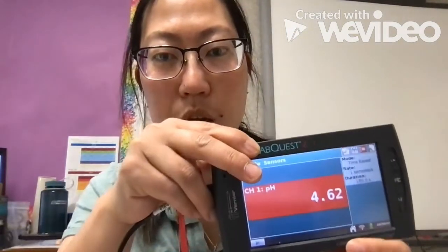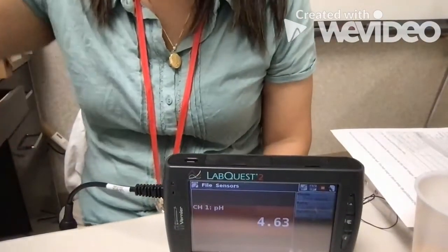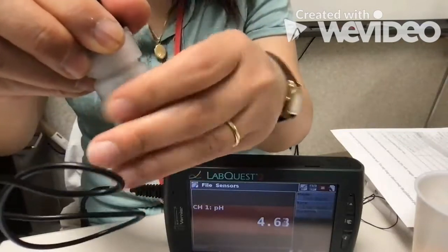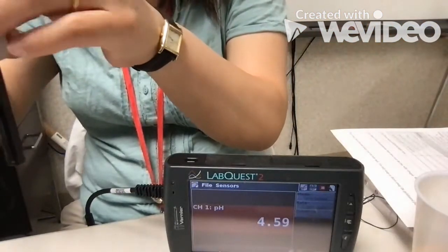The next part is testing pH with a meter. Okay, so now we're going to test the same solutions with a pH meter, and I have the pH meter right here. That's showing the pH. Let's see if I can get that showing. Okay, and the actual meter looks like this. It's a probe, and right now it's in some solution. I can take that out. Okay, and so it's a probe like this, and we just put it into a solution.